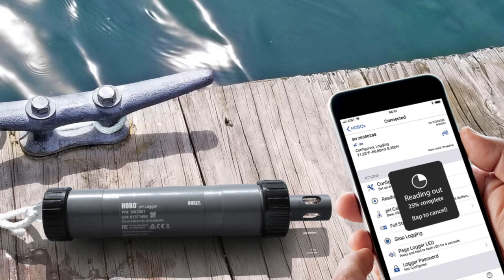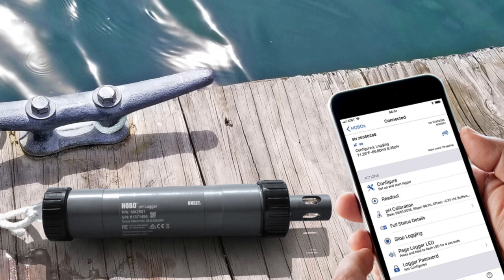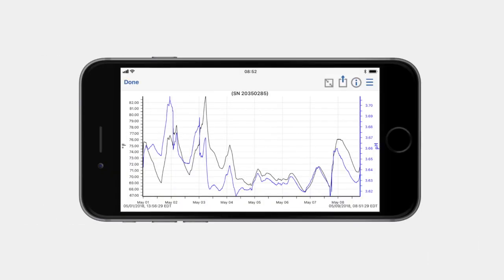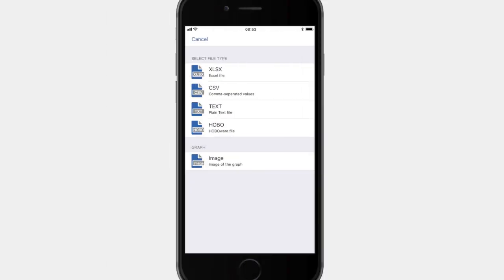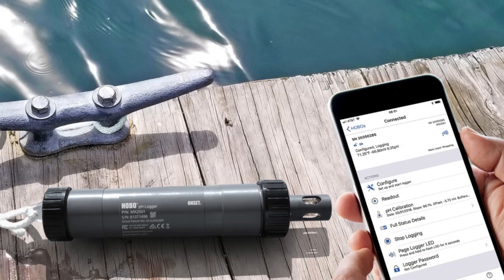Leveraging Bluetooth low-energy technology, the HOBO MX2501 communicates wirelessly with the free HOBO mobile app on your phone or tablet, making logger setup, calibration, and data offload quick and easy. You can view data and graphs, check the operational status of loggers, share data files and graph images, and store data in the cloud.